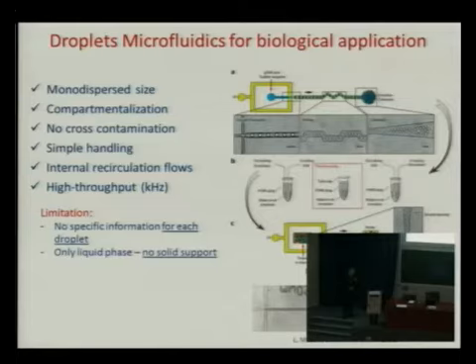That's because thanks to the microfluidic channel, it's now quite easy to generate emulsions where the droplets are basically really monodisperse and where all these droplets are completely independent from all the other droplets in the system. So every droplet can be considered as a single reactor. And it's also easy to work with droplets at kilohertz rate. So it's easy to generate and manipulate these droplets at a really high rate.